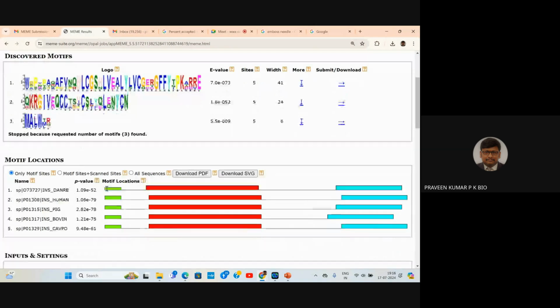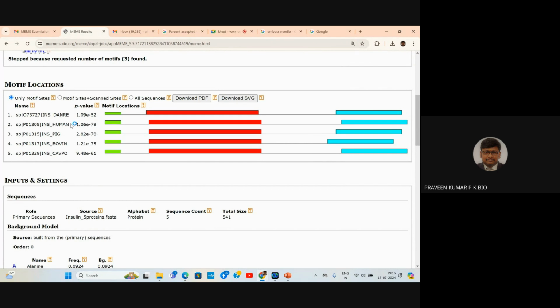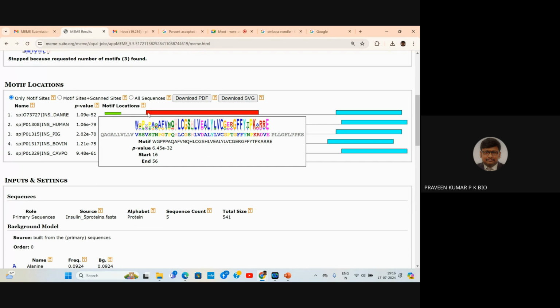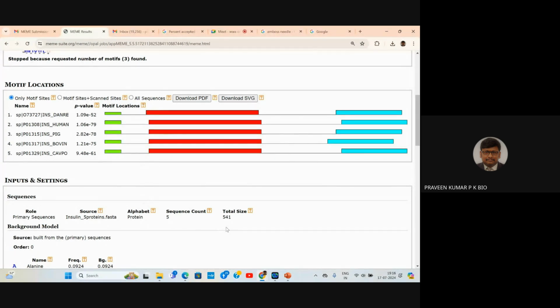Actually, if you see here, this is how we can find it. This is the output you can find here. So human you can find here. We observe here that the sequences are aligned properly in green, but in red, this red alone we have to adjust. If you can give one or two gaps, the red will be moved like that. Then obviously you can find more pattern matching, isn't it? I'd better use the pen. If I keep the red, you get it.